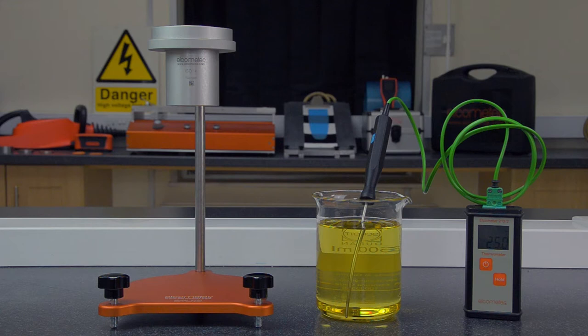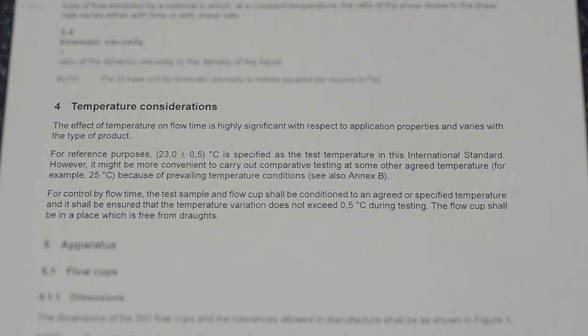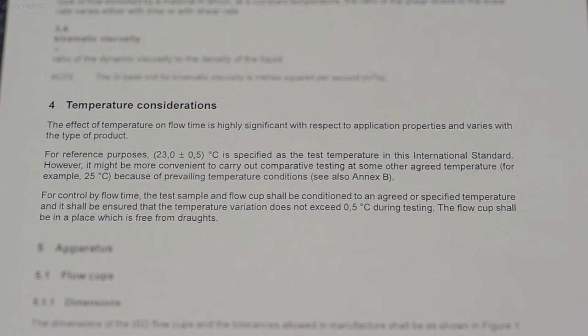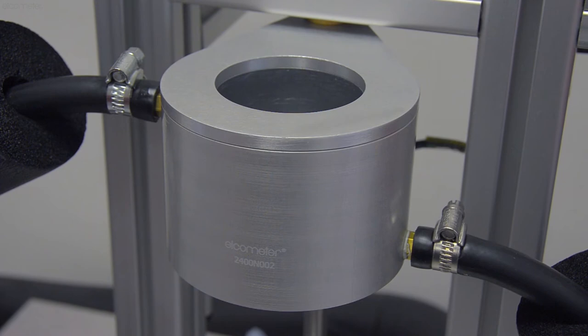Allow the temperature of the flow cup and sample liquid to stabilise at a uniform temperature. The temperature you test at will be dependent either on the test method or standard you're working to, the liquid you're testing, or on an agreed temperature by any interested parties. If you're not testing in a temperature controlled environment, then Elcometer's double-walled thermo jacket can be used to control the temperature of both cup and sample.